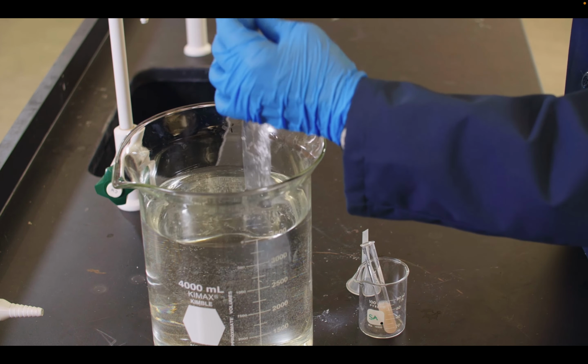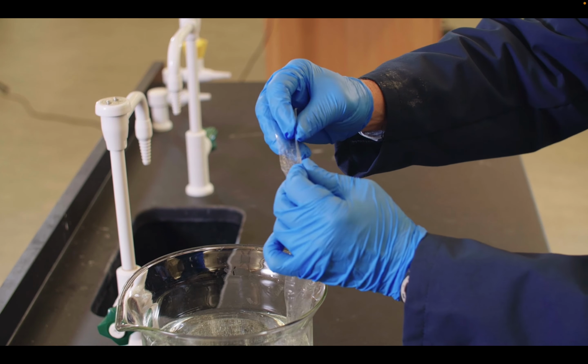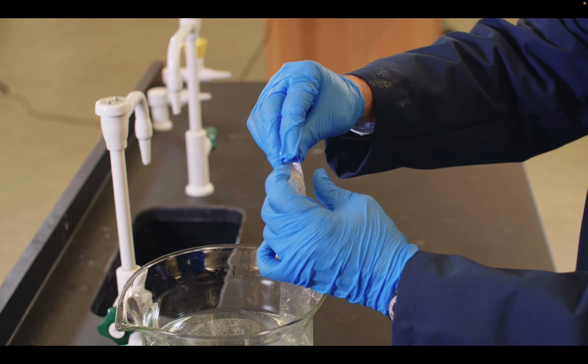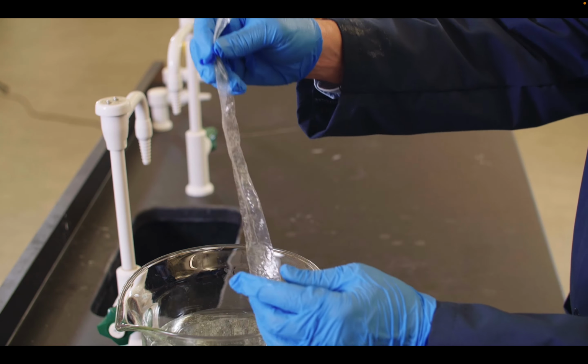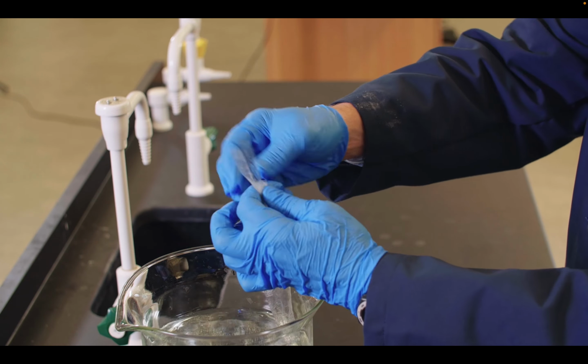And so dialysis is a technique where again we have dialysis tubing. This tubing's been manufactured in such a way that it has small holes that allow out water, salt, pretty small things. In this case, anything less than 10,000 molecular weight can get out, and then it retains things that are large. So to use this tube, we've been letting it soak, and it's open on both ends, so we need to tie knots in each end, and that'll keep the solution inside.